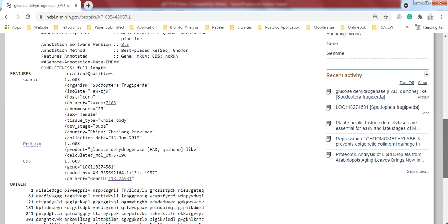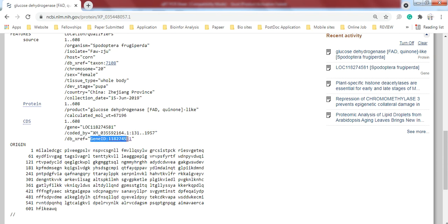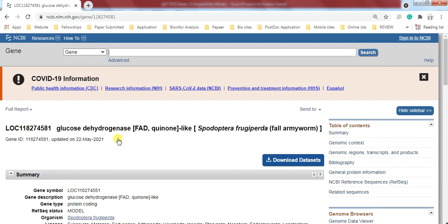But the important one is here: this one is the gene ID number. So you need to click on it. When you click on this gene ID, it will leave you another window.